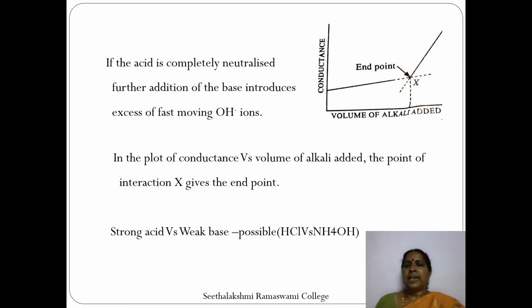Similarly, titration of strong acid versus weak base can also be performed. In this case, hydrochloric acid can be titrated with ammonium hydroxide, which is a weak base. Initially, a high value of conductance is observed due to the presence of H plus ions in hydrochloric acid.